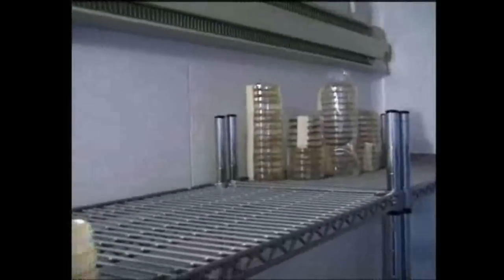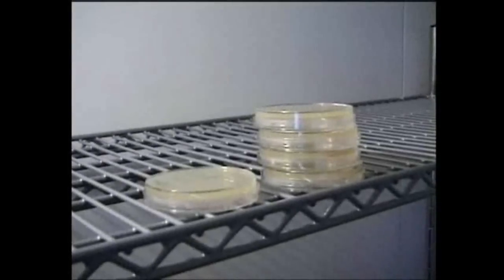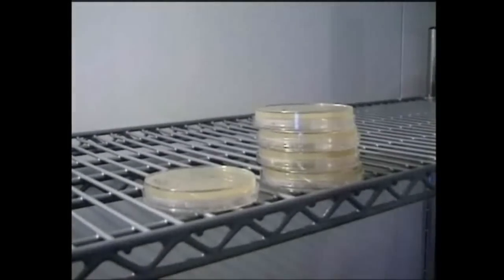It's generally agreed that in schools, 30 degrees Celsius is a suitable temperature for the incubation of bacterial cultures, whilst fungi should be incubated at 20 degrees Celsius.